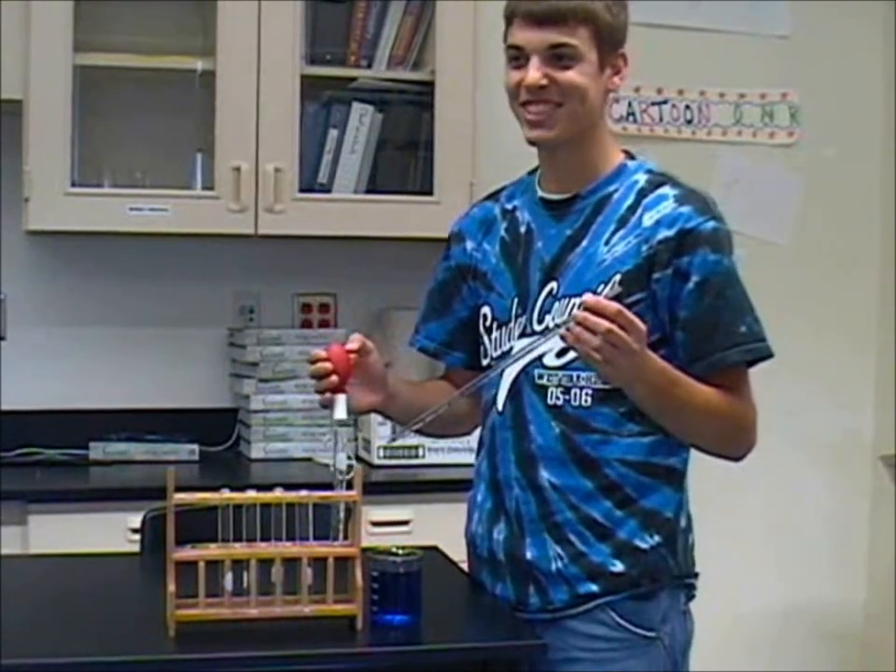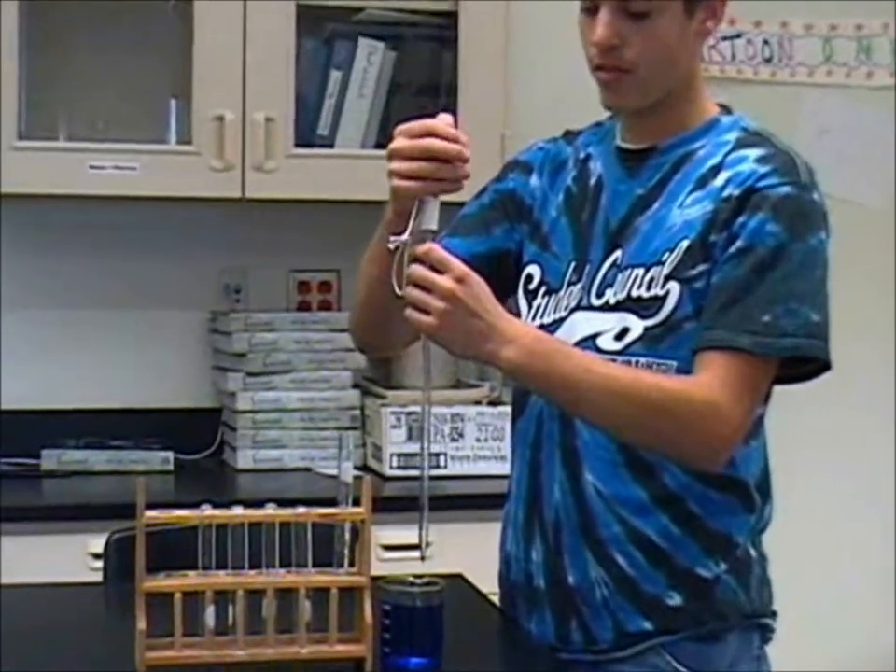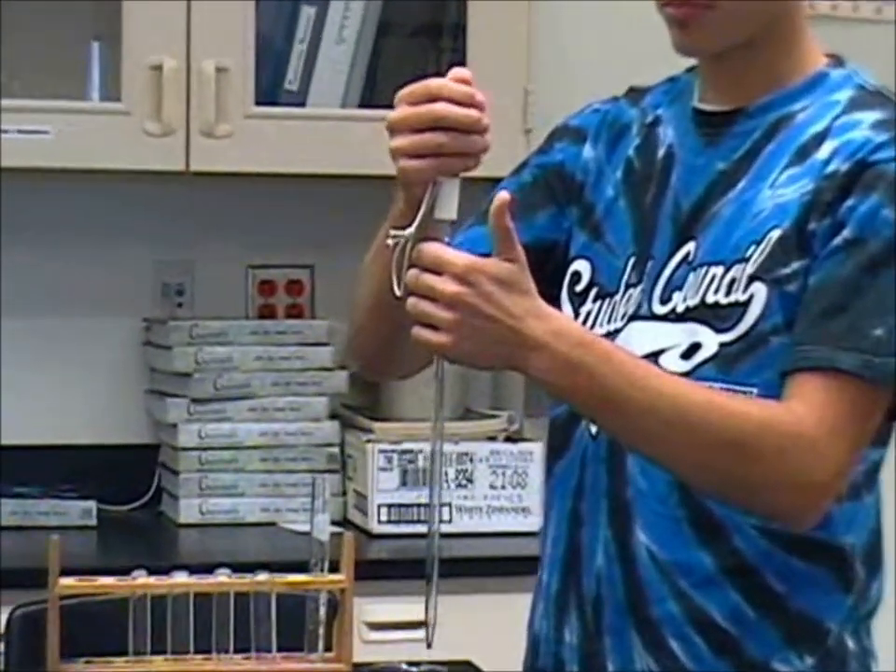First, snugly place the pipette bulb on top of the pipette, but not too tight. Keep your thumb upward so it is readily available for later.